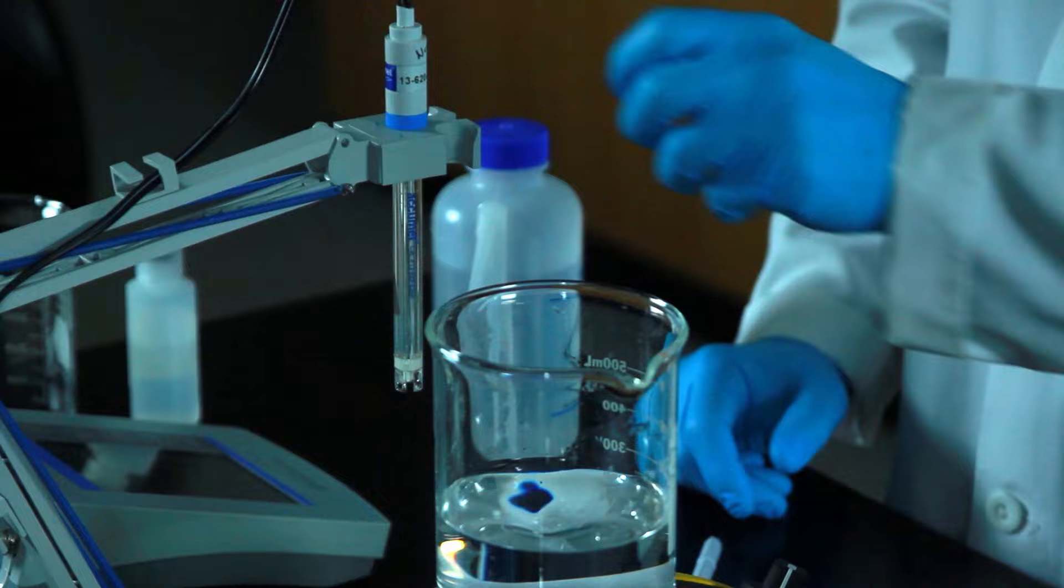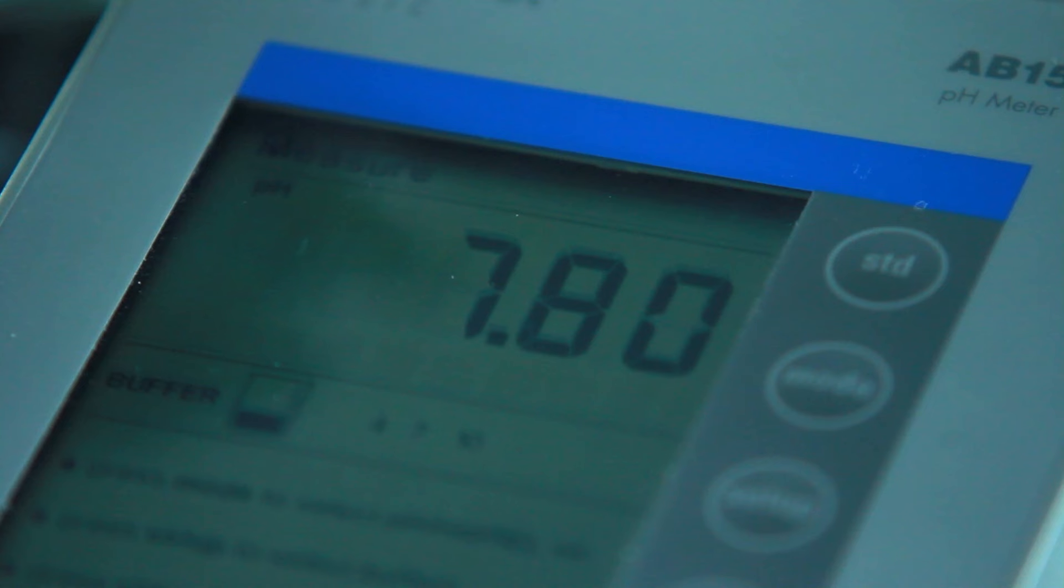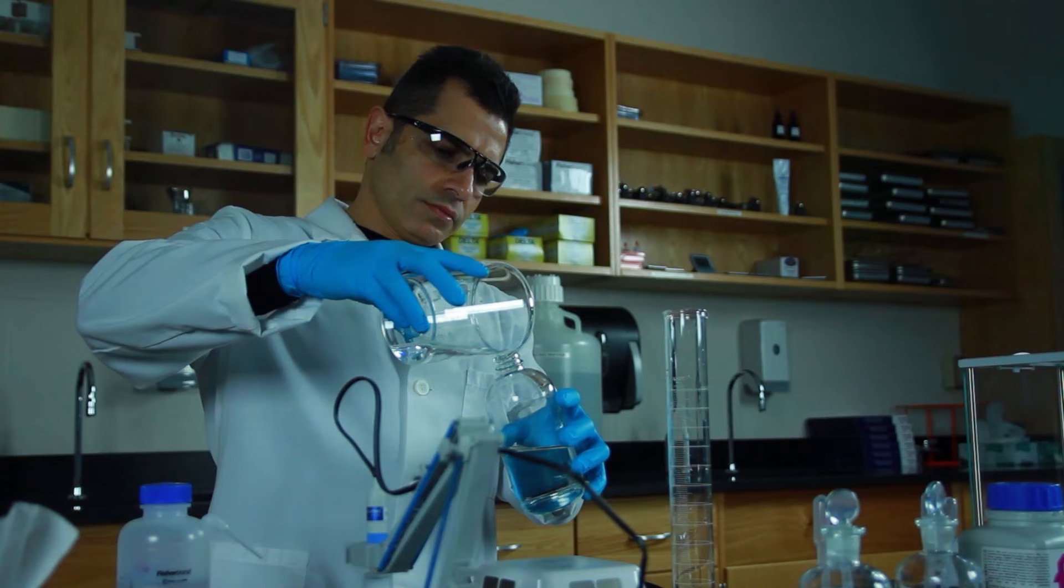Transfer the Tris buffer back into the beaker. Insert the pH meter probe and verify that the pH is still 7.8.